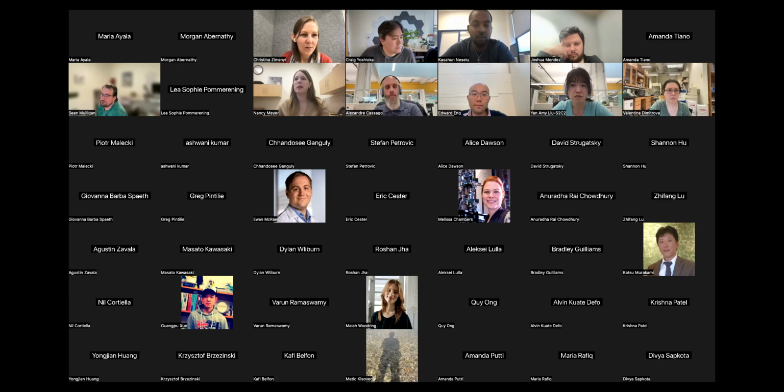And then also I use the GP2 to freeze. It's hard to change the blot force because the GP2, the Leica, doesn't have that parameter. Has anybody seen any problems with the C-flats ripping off or any suggestions on what I can do for that? Are they 200 mesh? Yeah, I was going to ask also if they're 200 mesh. You can order the thicker ones, and I've had more success with those. I think they're called T50s.